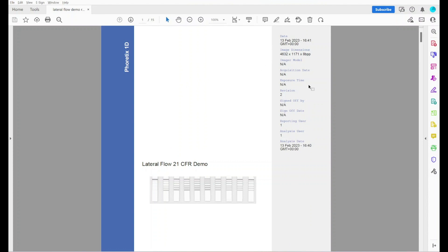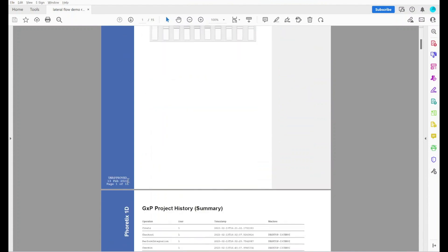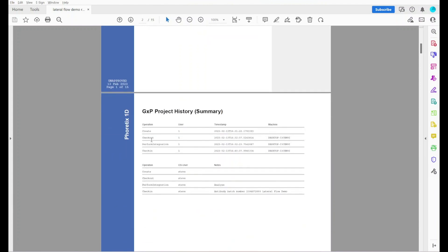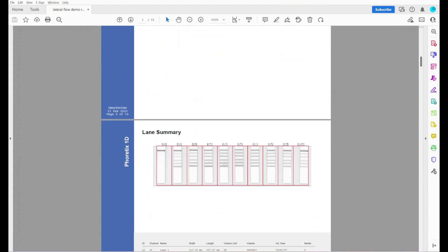We've got various information about the image on the right-hand side, including if the project has been signed off and who it was signed off by. By now, this project has not been signed off yet. We've got the revision number that this particular report came from, the analysis date, who did the analysis and who created the report, which is username 1. Image information, a copy of the image and you can see down here that the project is unapproved. We've got the full audit trail here, including the machine name, the timestamp, the user, the operations that were performed on the data, the operating system user and the notes.